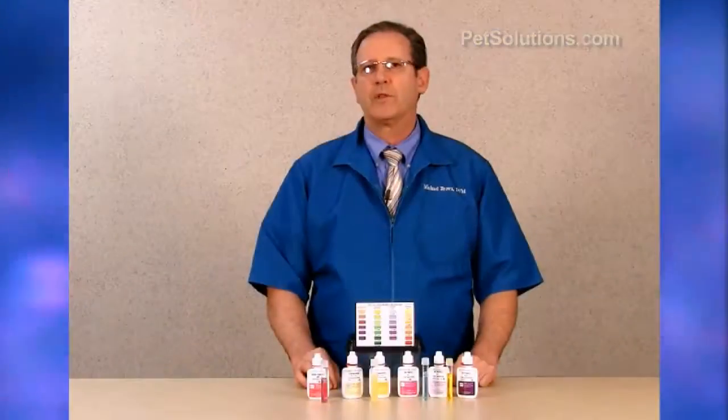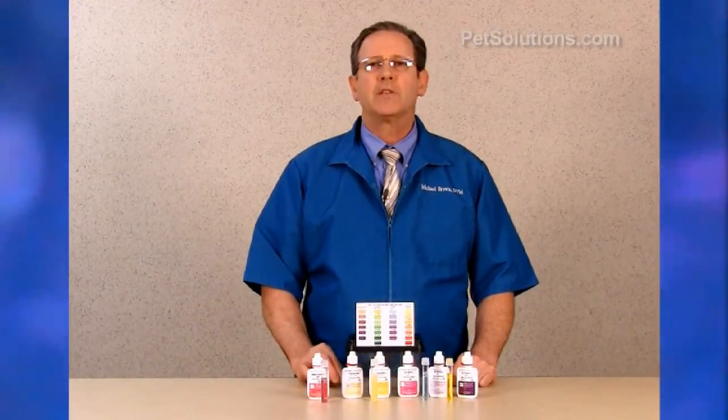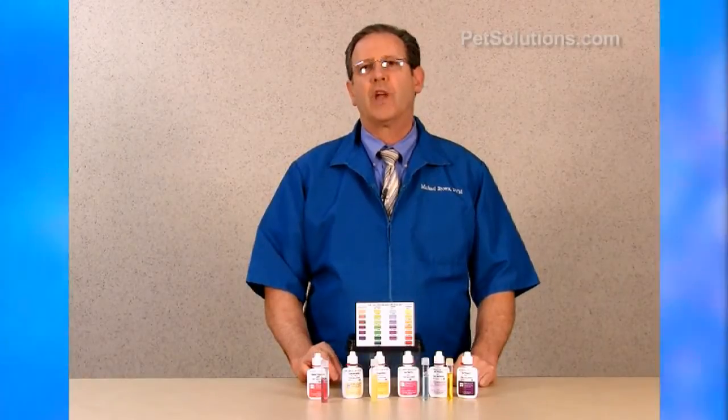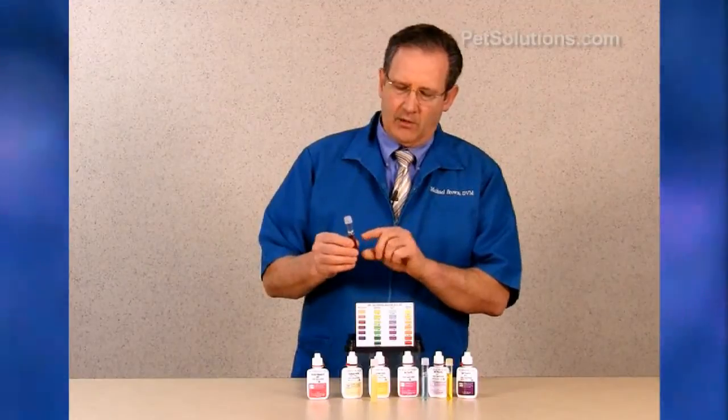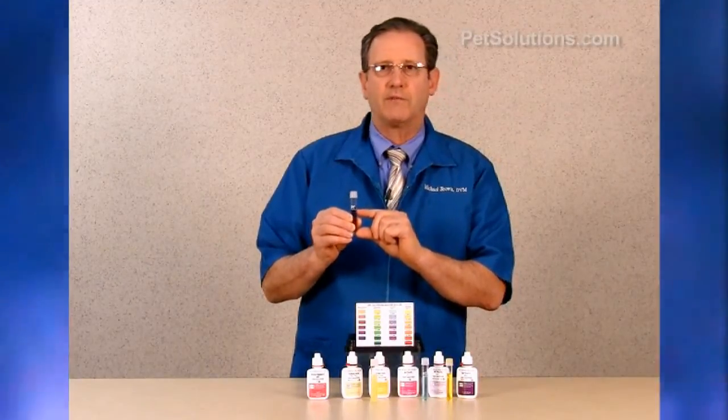A pH of 8.2 to 8.4 is ideal for saltwater fish and invertebrates. To measure the high pH, take a clean vial and fill it to the line, which is 5 mLs.